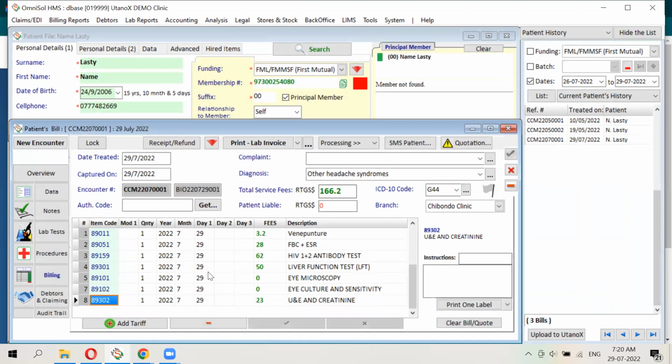No, okay. Here, let's say we have liver function test, right? We don't want to remove the whole of the liver function test, but we want to remove some of the tests in the liver function test. Yeah, what I illustrated was that I removed just one line, of which there are multiple lines per test already. Multiple billing lines per test because of the billing components. And what I illustrated is the fact that you can remove an individual line. Okay.